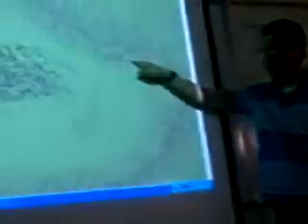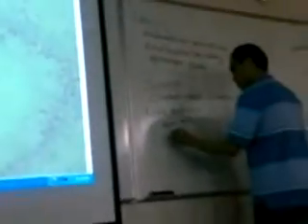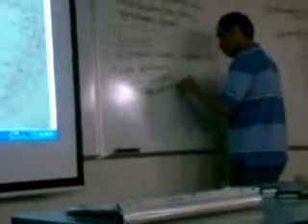Identify this epithelium here. It's kind of like a pseudostratified columnar epithelial tissue with stereocilia. I guess I could point to that.